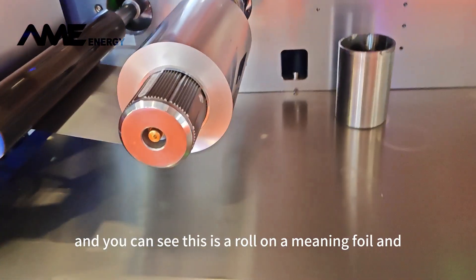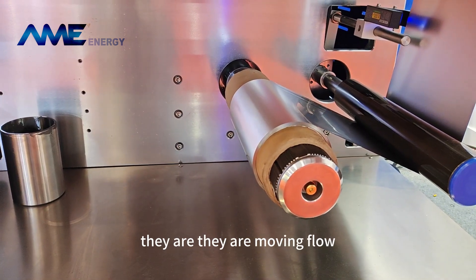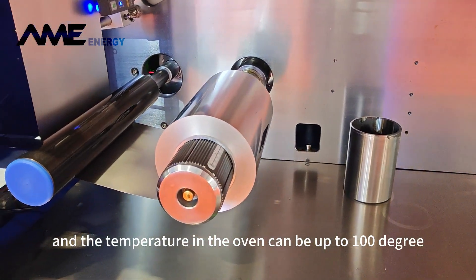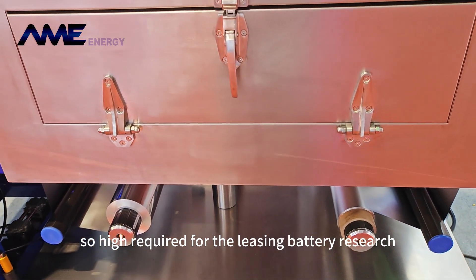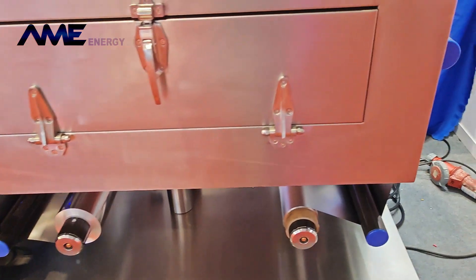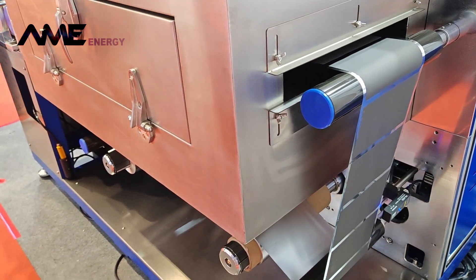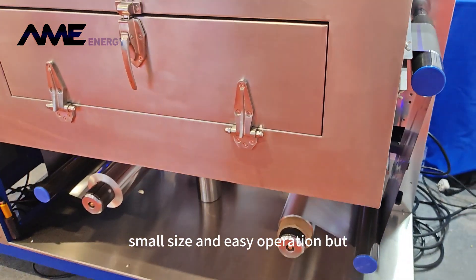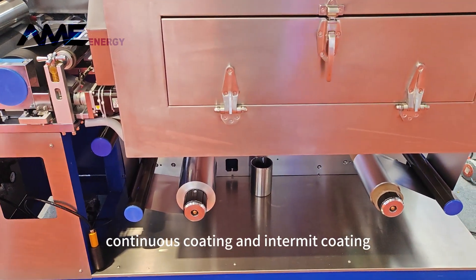You can see this is a raw aluminum foil and this is a wound electrode — they are moving slow. The temperature in the oven can be up to 100 degrees, which is actually sufficient for lithium battery research. There is also a blower inside the oven to circulate the air inside. That is for the roll-to-roll coater — small size and easy operation but quite functional. You can do any type of coating: continuous coating and intermittent coating.